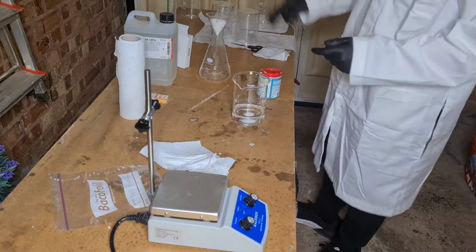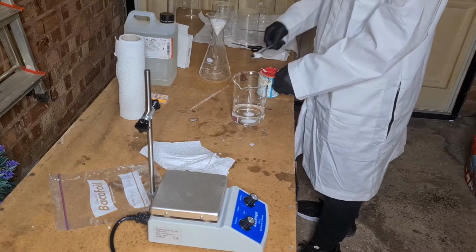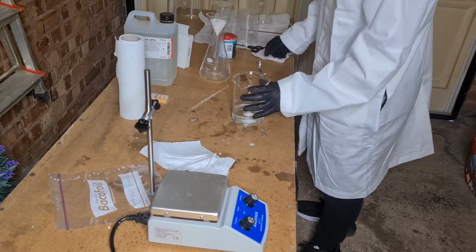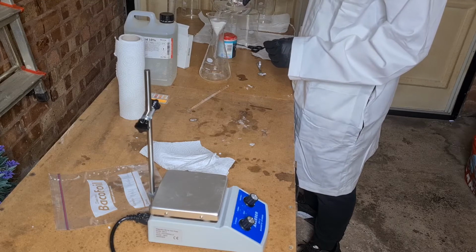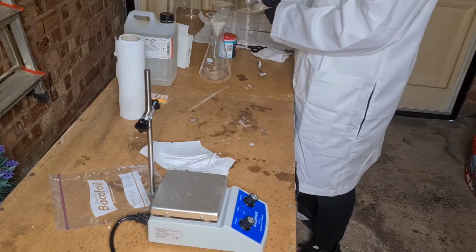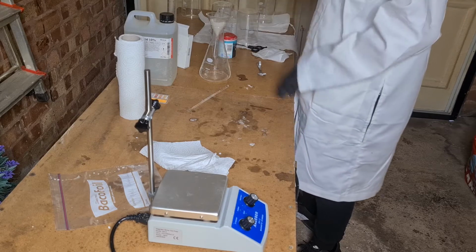You can just use cotton buds, that works fine, but I fancied and decided to use filter paper. Right, so we just pour it in a bit at a time and it will filter through, and as you can see it's coming out in the bottom. That wood shaving that was floating around in here will also get filtered off.